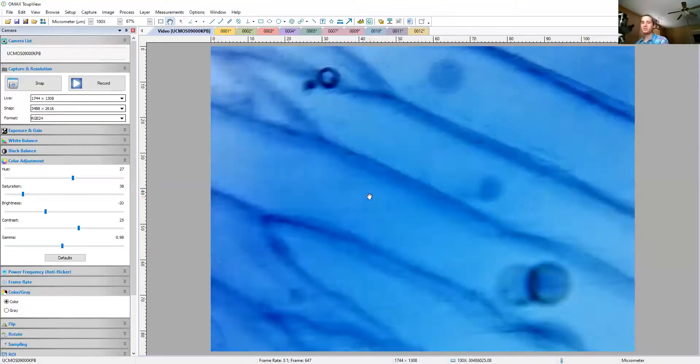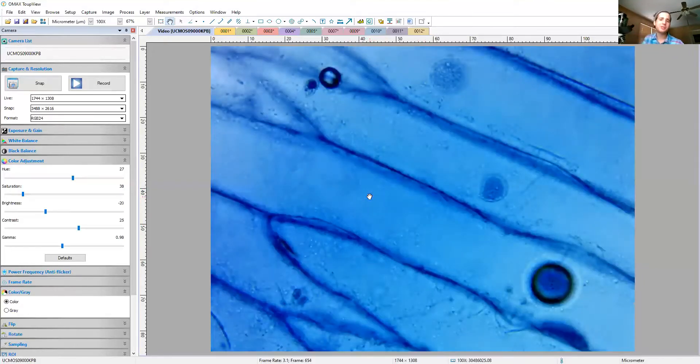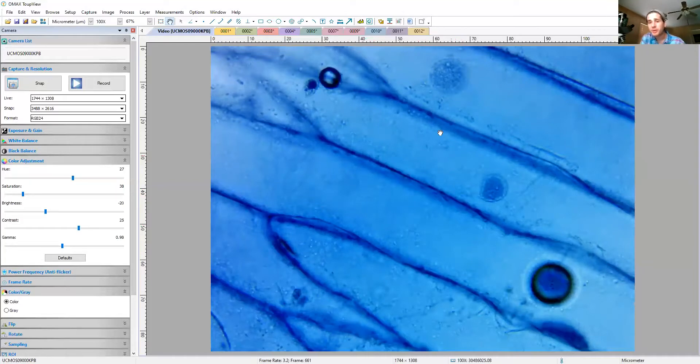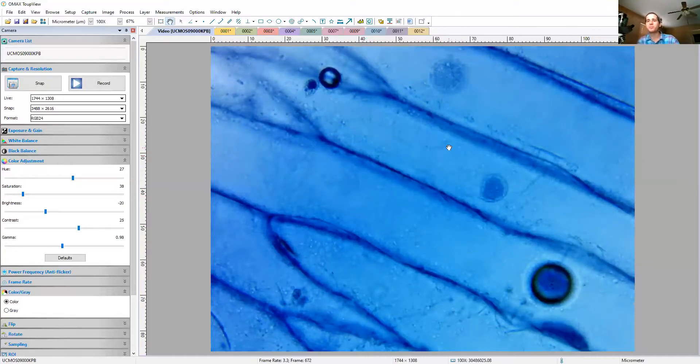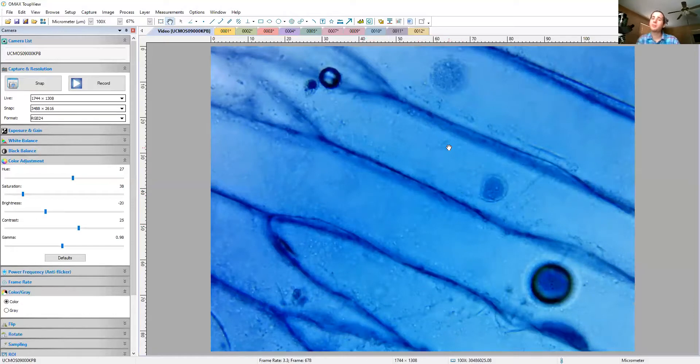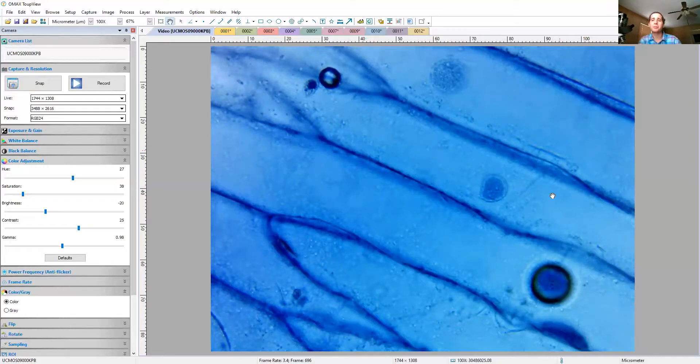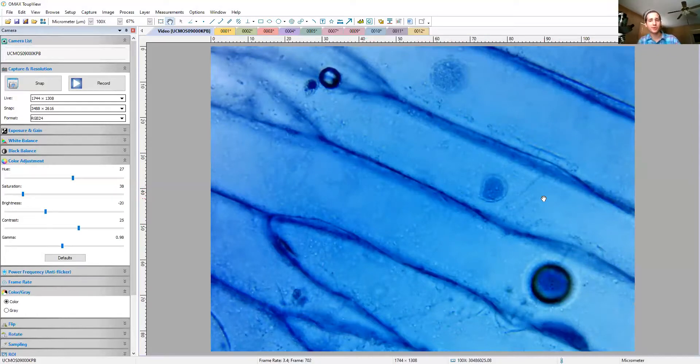That is the only feature you need to be able to distinguish this organism as a eukaryotic organism. Additionally, you can see that these cells are arranged together forming a tissue of some sort. That's another thing that only eukaryotes are going to do.